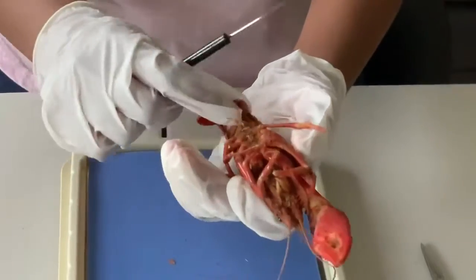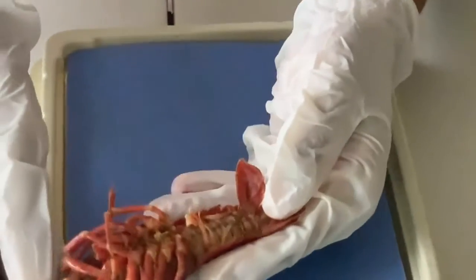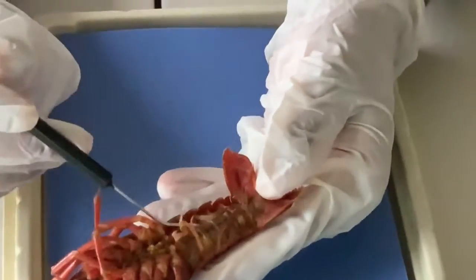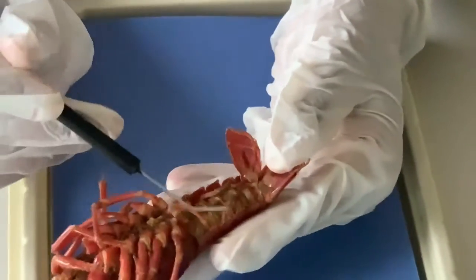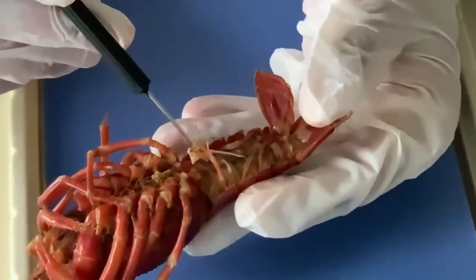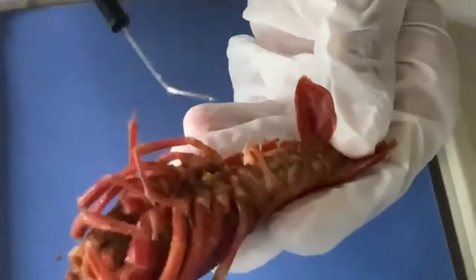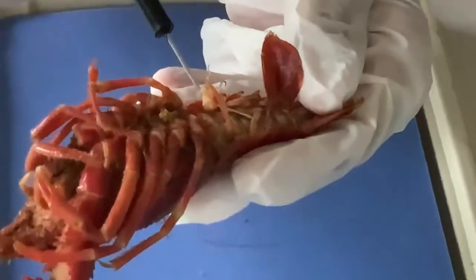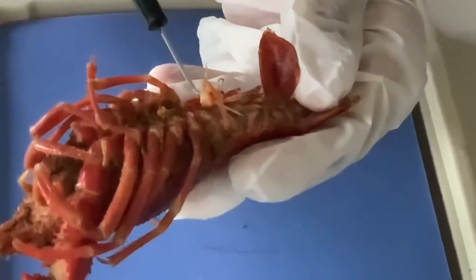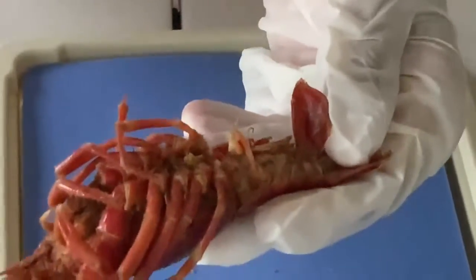Underneath the walking legs are the swimmerettes. You can see these thin feather-like structures over here. Swimmerettes have two uses: they are used to help swim, and they are used to hold eggs in a female.